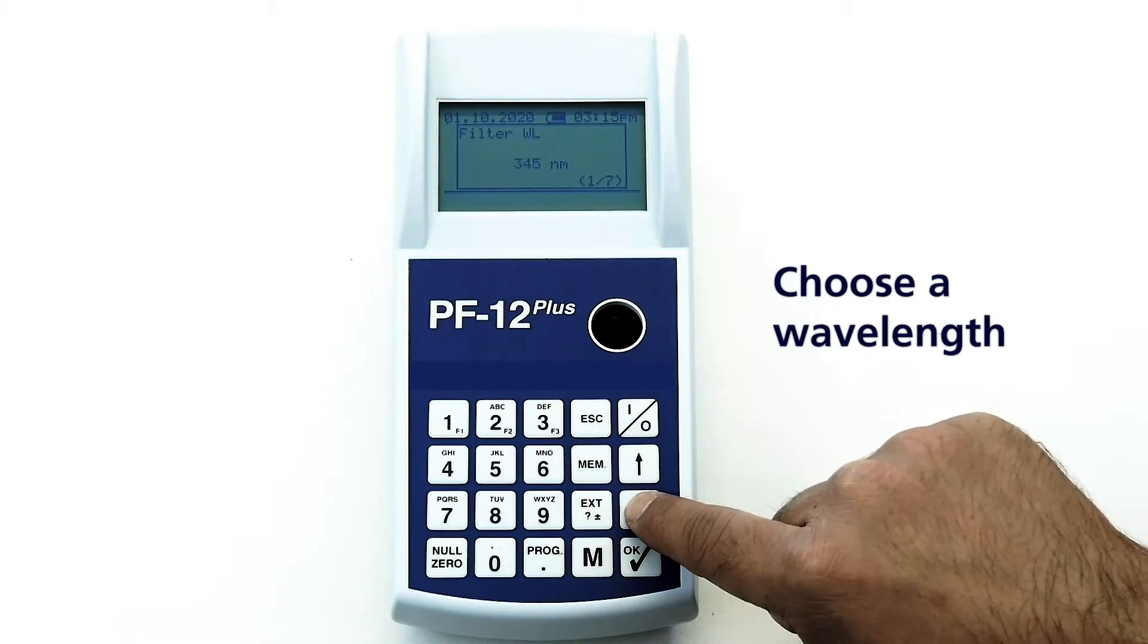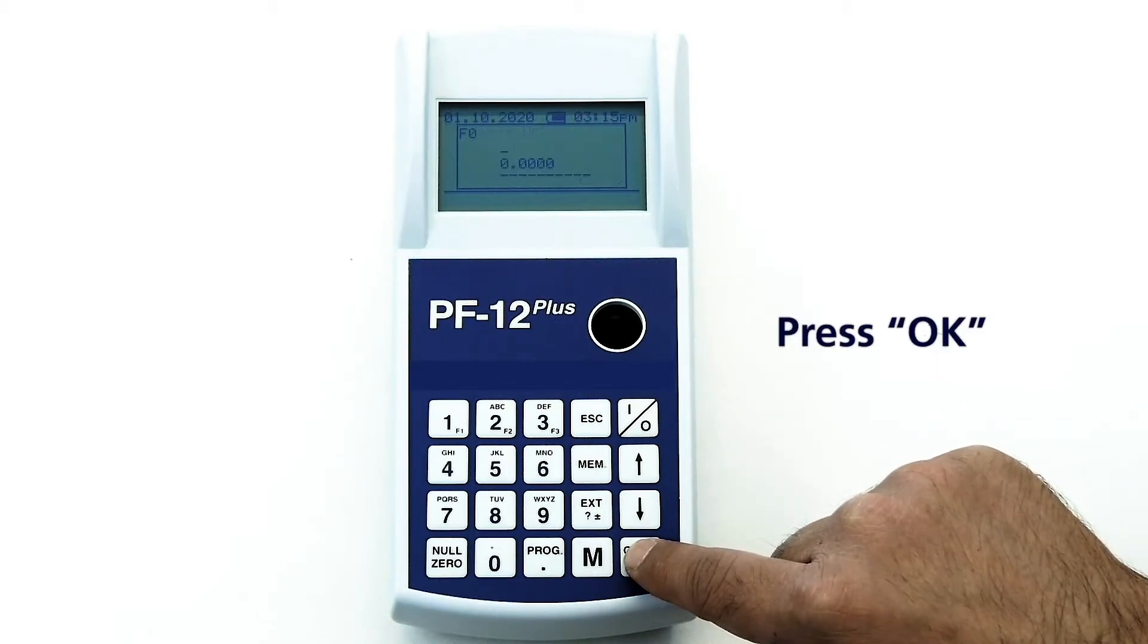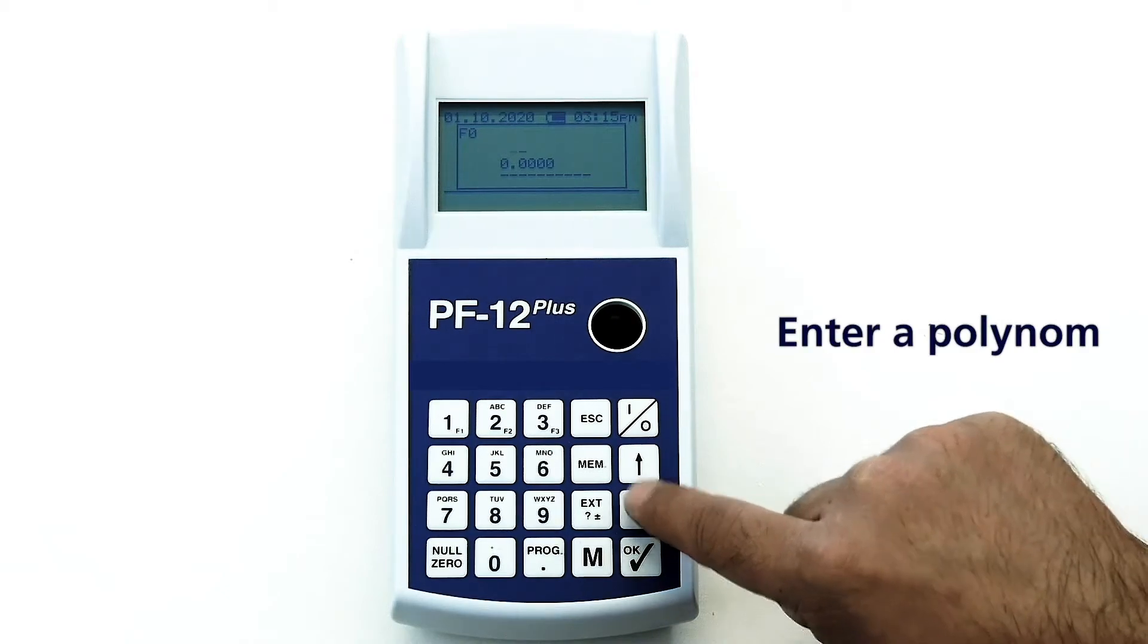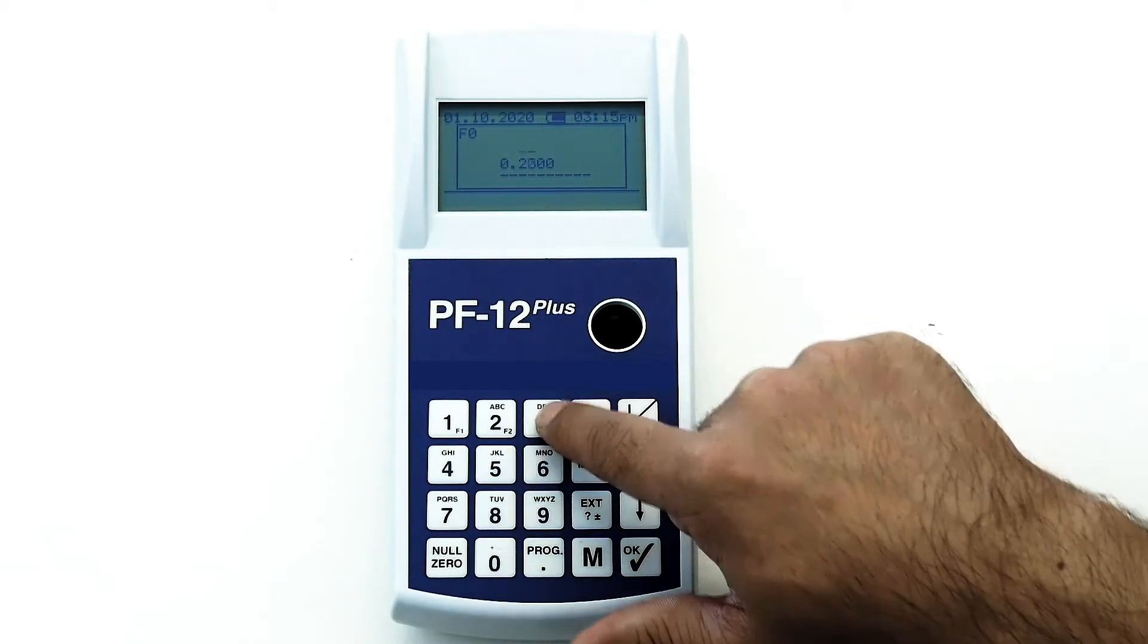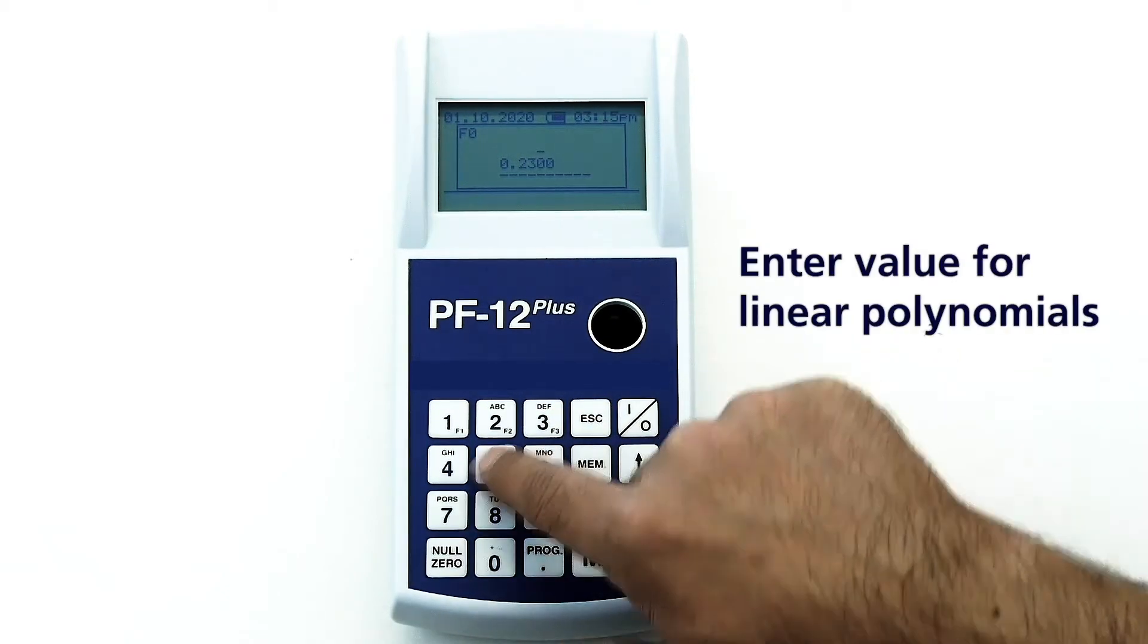Choose a wavelength. Press OK. Enter a polynomial. For linear polynomials you need to enter value for f0 and f1.